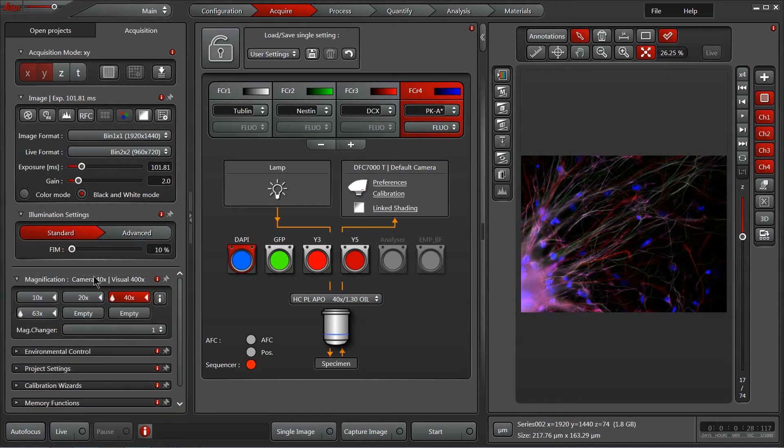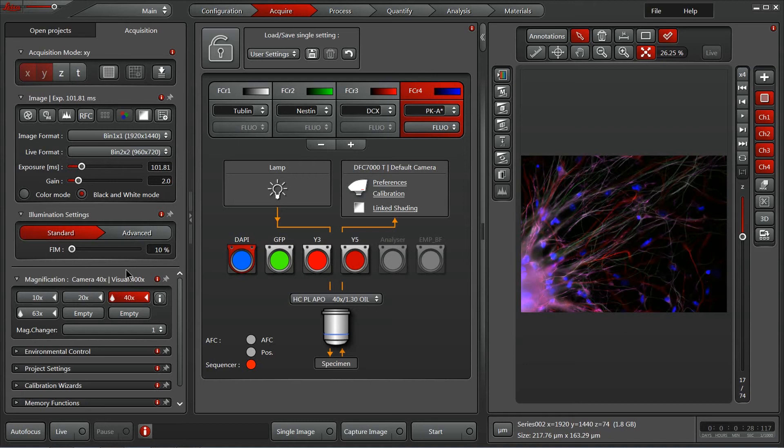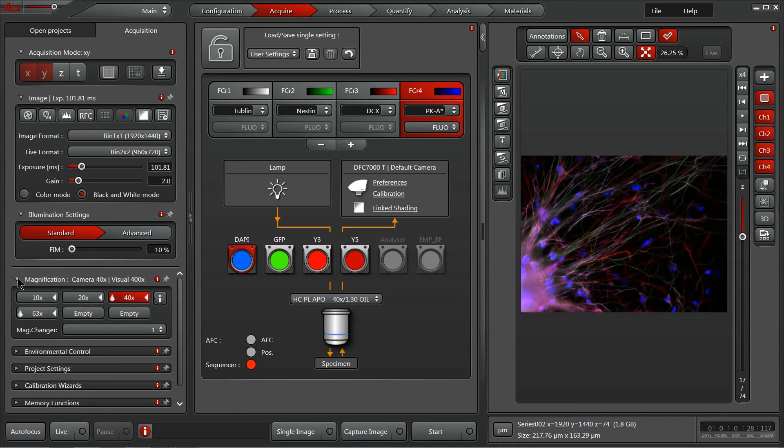We also have our magnification control. Since there's a motorized nosepiece on this microscope, I can click and change between different objectives. Some systems aren't motorized but are encoded, in which case you'll be able to easily see your objective being displayed here, but you'll have to reach over to the scope and manually change them.